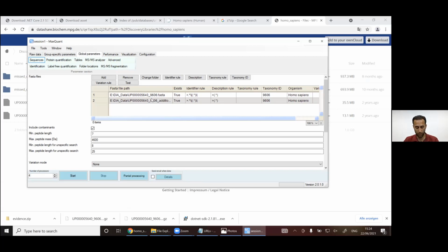The main difference between the complete submission and partial submission is that you use a standard file format. In this case, Pride accepts mzTab and another format called mzIdentML. We provide the mzTab, and what happens is that they give you an identifier, and some journals actually require this, and it's also better for the community if you're sharing your results in that way.